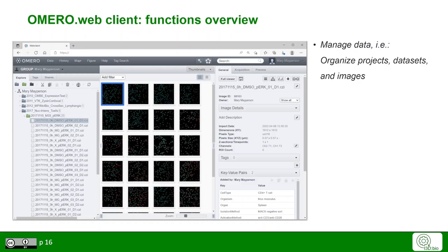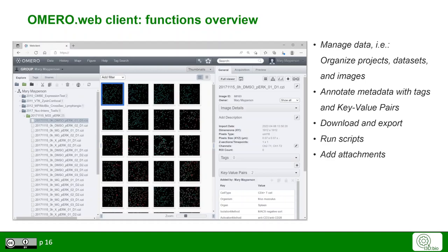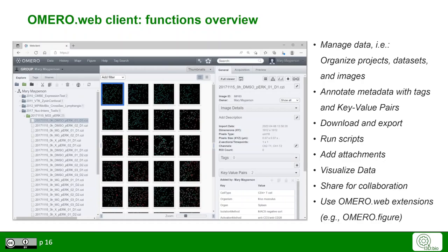Use the OmeroWeb client to manage your data. That means to organize your projects, datasets and images therein, to annotate the metadata with tags and key value pairs, to download and export images, to run scripts on the server, and to add attachments. Here you can also visualize your data and share your data for collaboration. Depending on your installation, you can make use of the various OmeroWeb extensions.